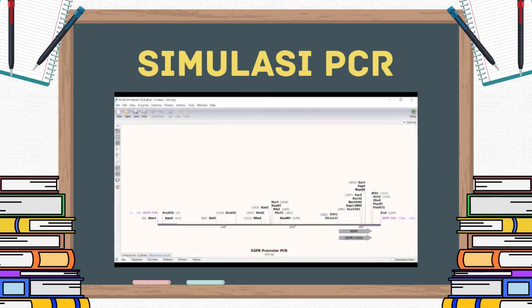And that wraps up this video tutorial. In this tutorial, you have learned how to create primers and to simulate PCR.